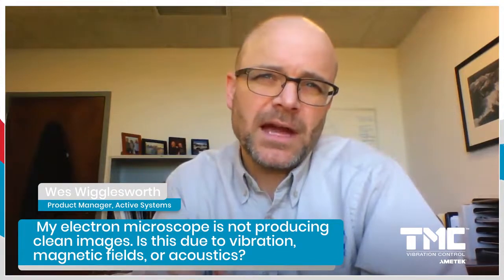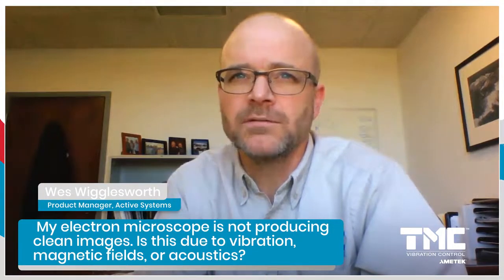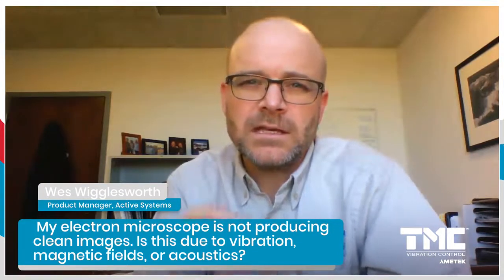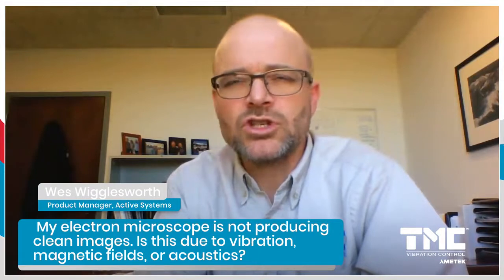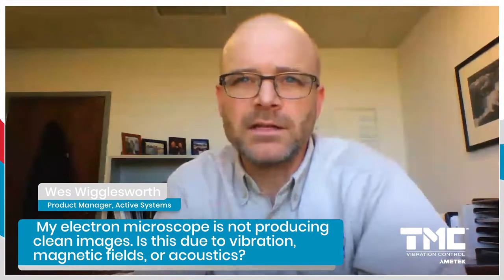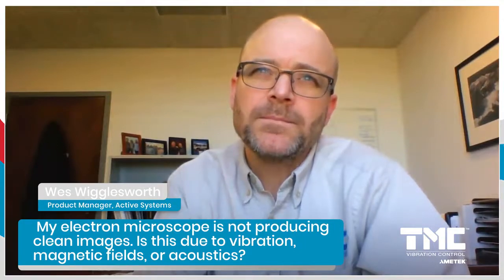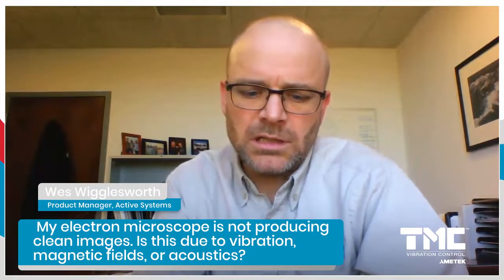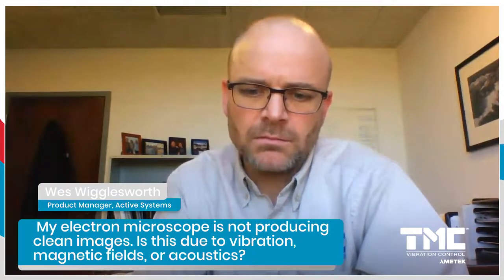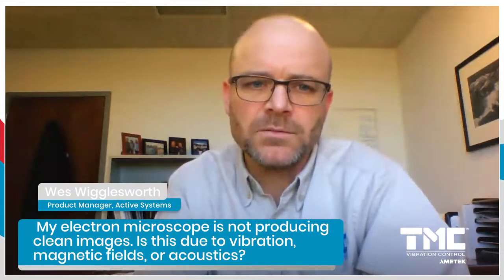I will say that sometimes you can see it in the image. Somebody who's got really good experience of looking at an image and seeing a type of deformation in the image or jitter in the image might be able to tell that it's a low frequency compared to a high frequency, but that can be pretty challenging to do consistently and really nail it down. So I would say that the field survey is the best way to go about that.